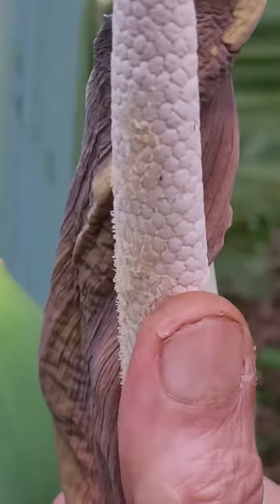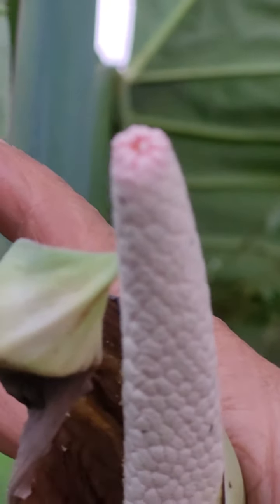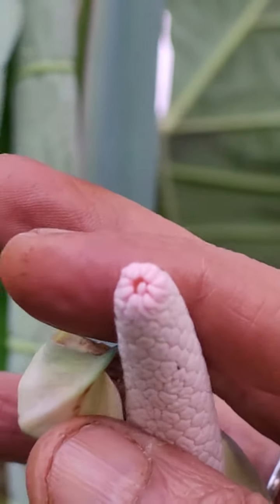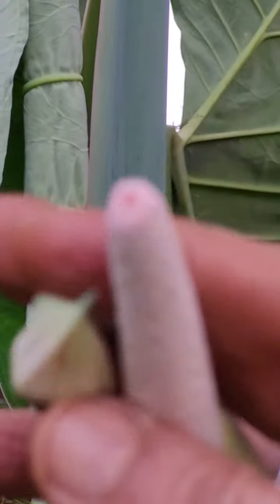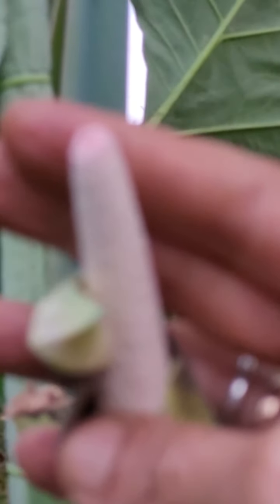In the upper part you can see the pollen particles. Can you see some small small things? This focusing is a big headache. You can see the tip — this pink part has some flower resemblance actually. Then the focus is going off.